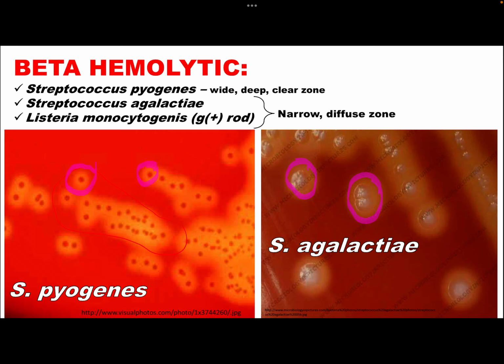Sometimes during initial culture, or maybe when the colonies are still young, the hemolysis is not yet that distinct, so you have to remove the colonies to see the beta hemolysis. Those are again Streptococcus pyogenes and Streptococcus agalactiae. I mentioned earlier that the alpha and beta hemolysis on BAP should not be mistaken for the greenish coloration on chocolate agar, because true hemolysis is not observed on chocolate agar. So that should not be mistaken as alpha hemolytic on chocolate agar.